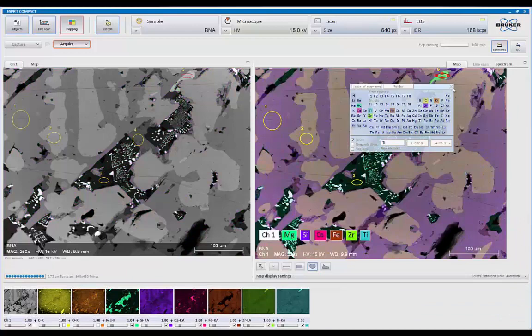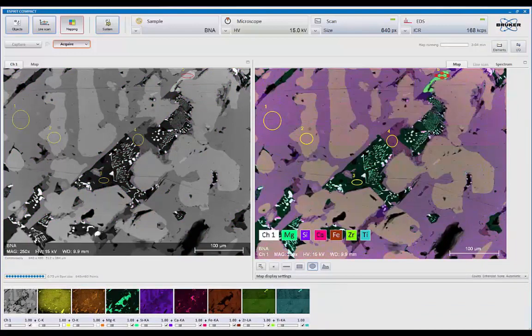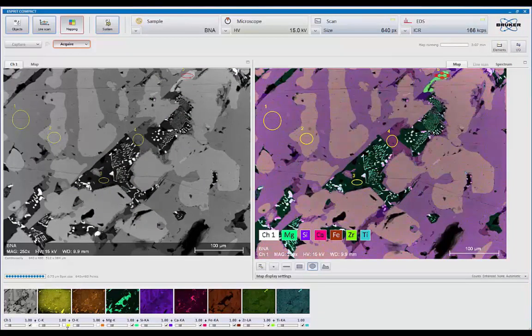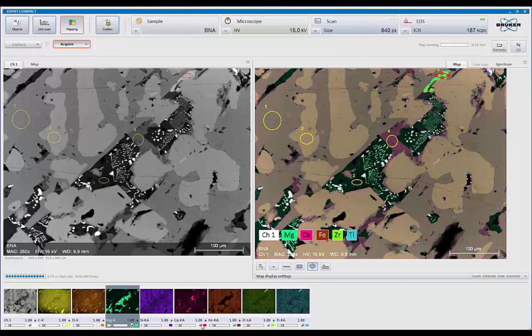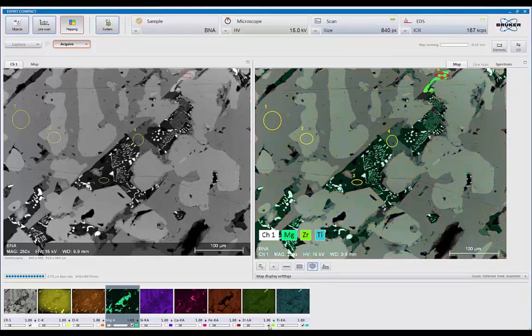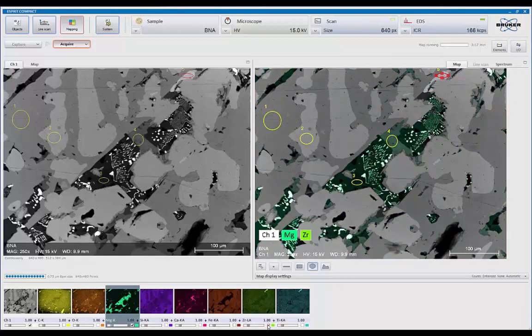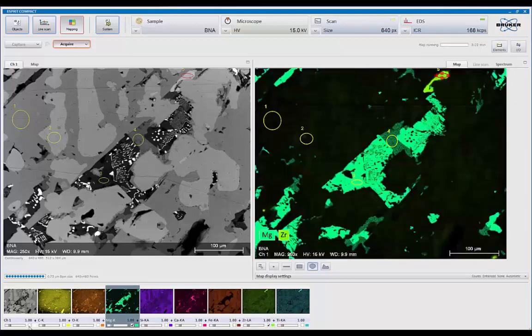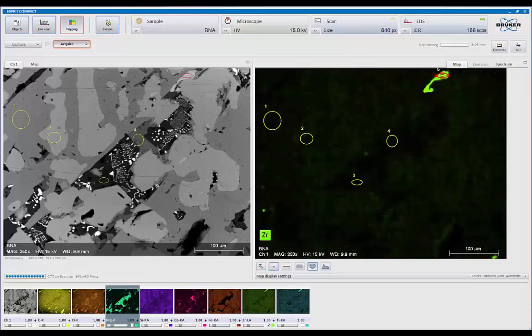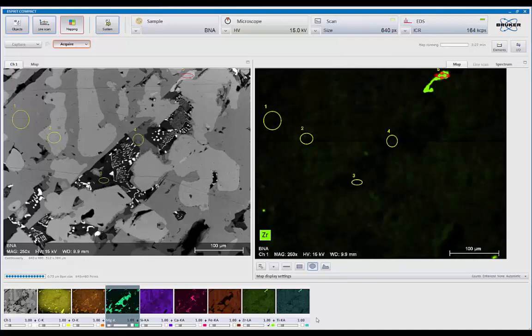And as soon as I add those elements to the list, it adds it to the map series. So if we go back to map now, they're my individuals. So I can turn off the other ones, but the new ones. So I'm just going to simply click on them. So here is zirconium's contribution. In fact, we turn off the image. And magnesium.